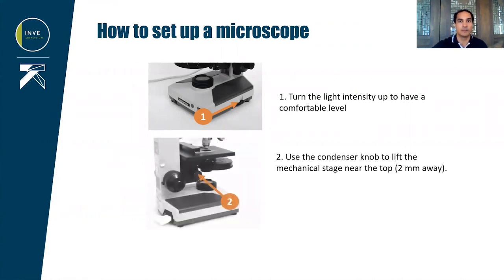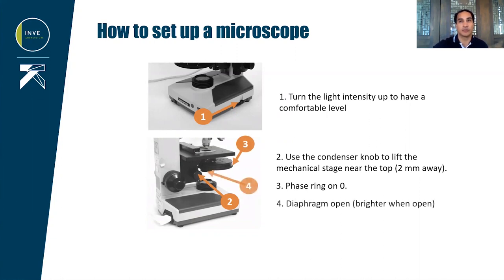Use the condenser knob to raise the condenser so it will reach near the top. Then, if the microscope has a phase ring, bring it to zero and open the diaphragm to let in as much light as possible.